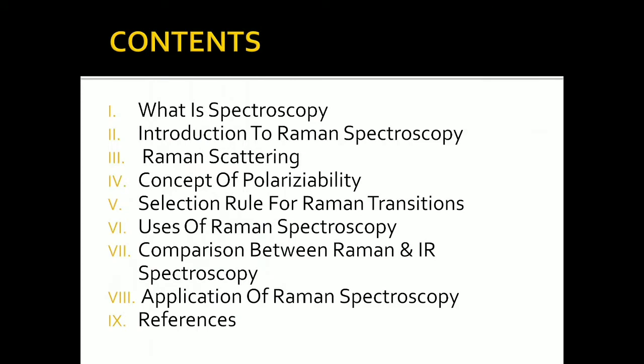These are the contents covered in this topic. Of course, we will see what is spectroscopy, introduction to Raman spectroscopy, Raman scattering, concept of polarizability, selection rule for Raman transitions, uses of Raman spectroscopy, comparison between Raman and IR spectroscopy, application of Raman spectroscopy.